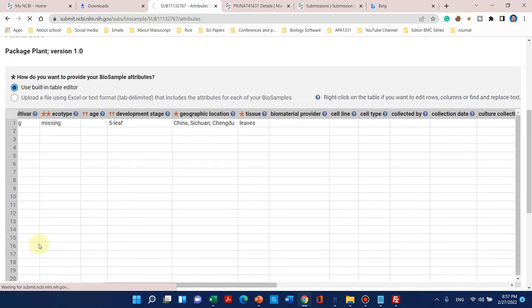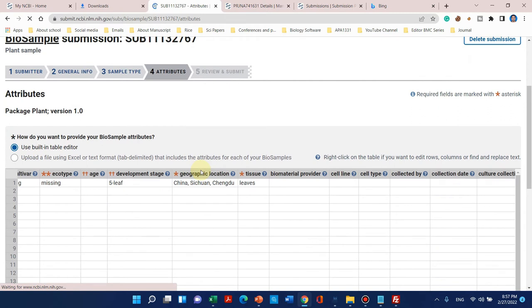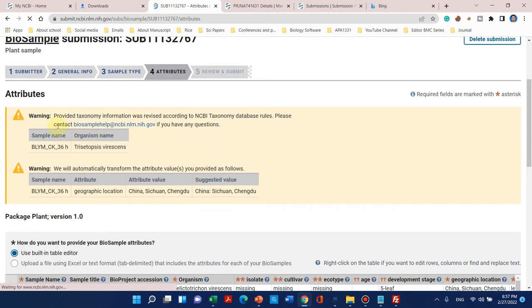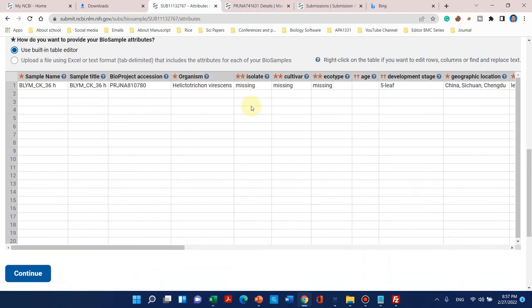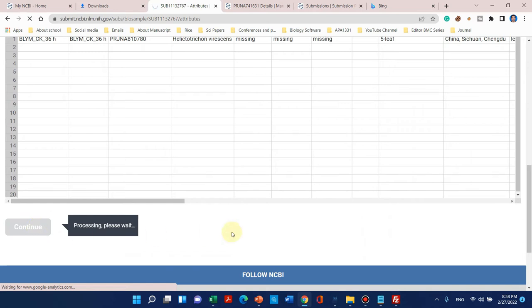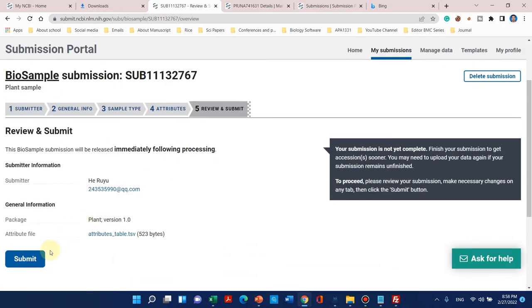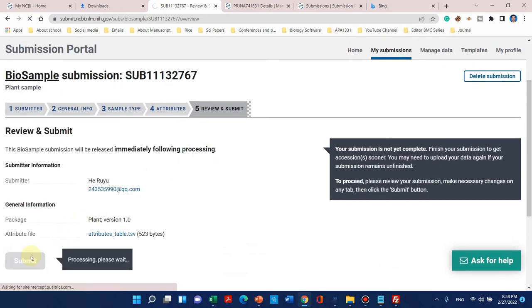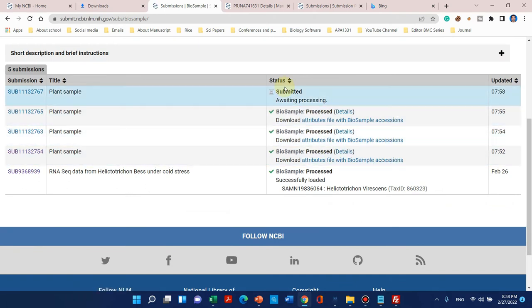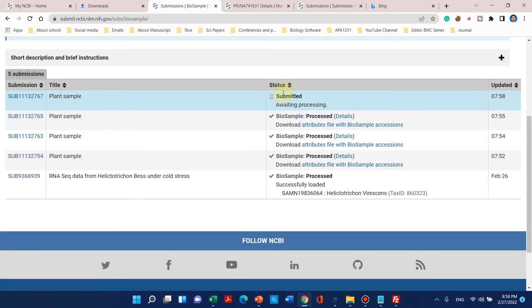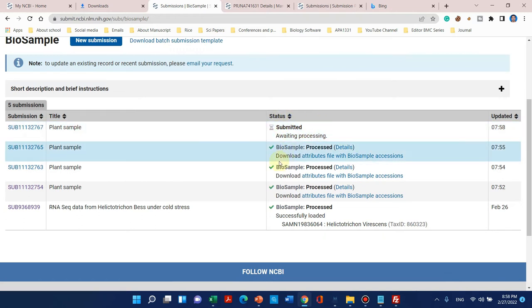It may show a warning, but that's okay — warnings don't necessarily mean an error. You can leave it as such and click continue. Then you can submit. We can see one, two, three, and the fourth one is submitted and awaiting processing.